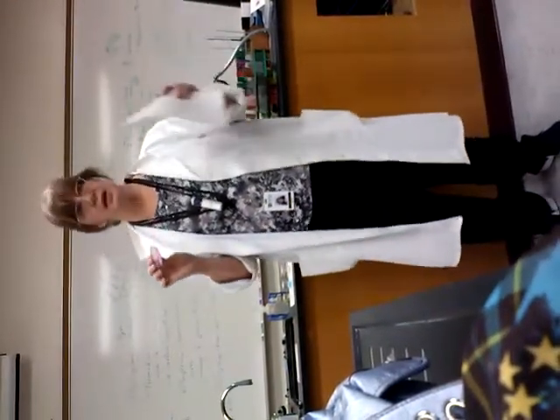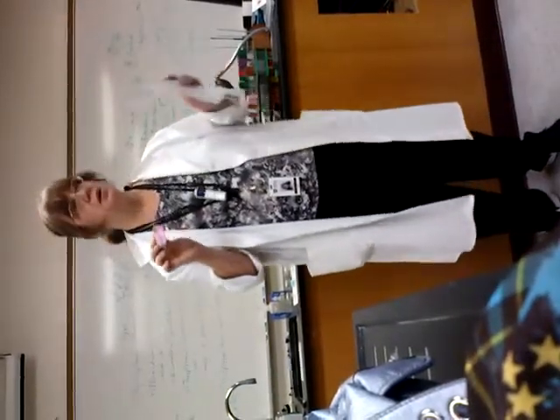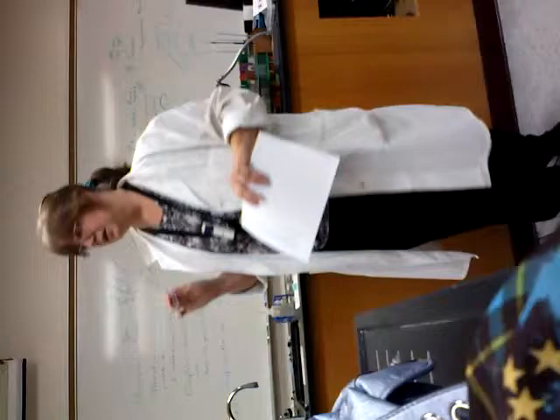What is coliform? E. coli is what indicates presence of fecal matter. The definition of the group is from the intestine, gram-negative rod, positive for lactose fermentation. Now, talking about lactose fermentation, what are these two plates?